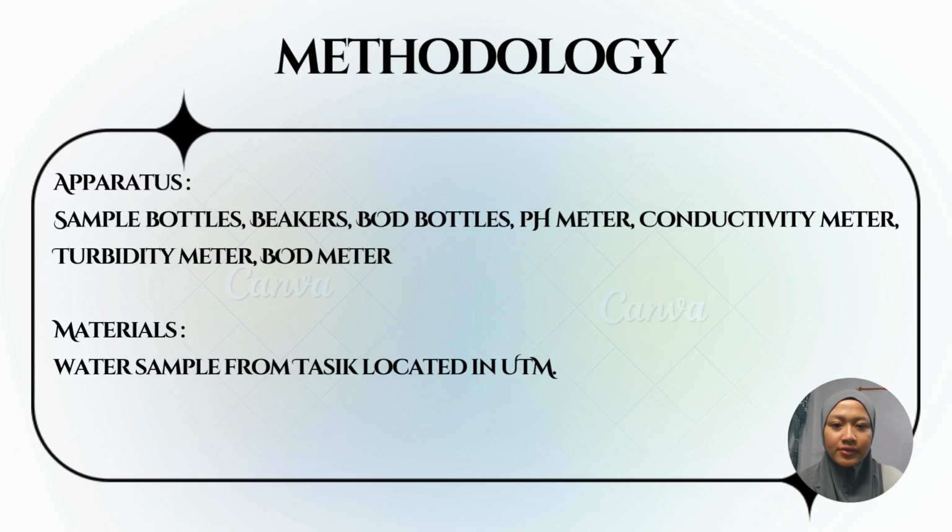This is the methodology for this experiment. The apparatus of this experiment involves sample bottles, beakers, BOD bottles, pH meter, conductivity meter, turbidity meter, BOD meter, and the material is a water sample from Tasik located in UTM.